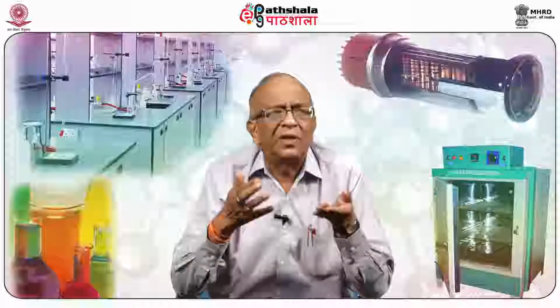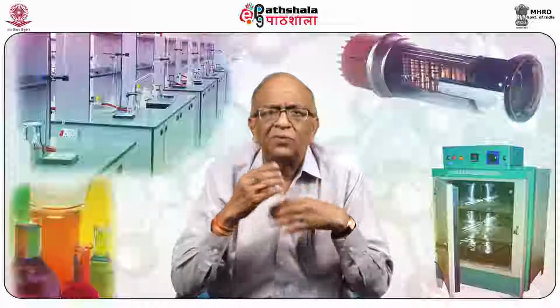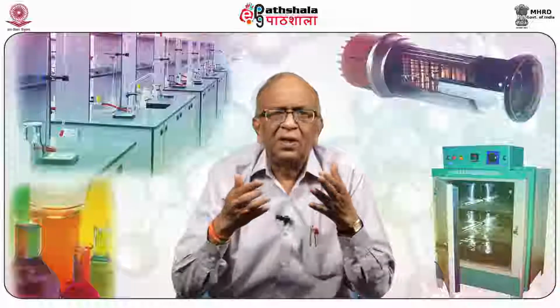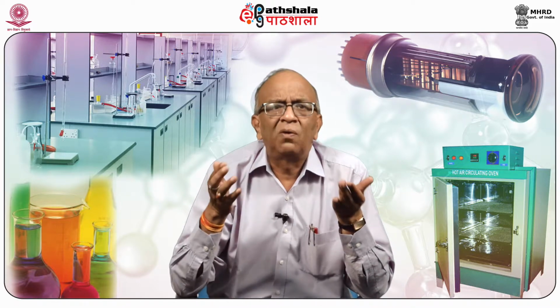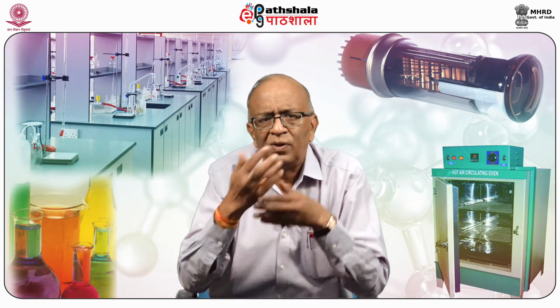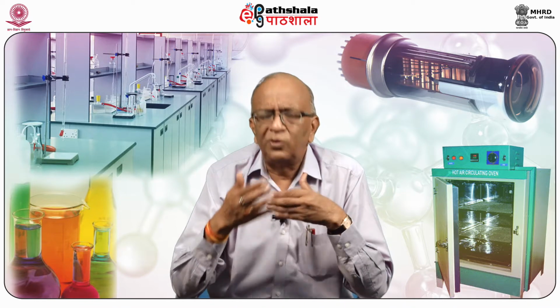Various other physical changes may take place, but side by side, various chemical reactions take place. In many cases, the compound may decompose, as in the case of calcium carbonate. At a particular temperature, carbon dioxide gas is released and it forms calcium oxide. Such types of decomposition may occur.